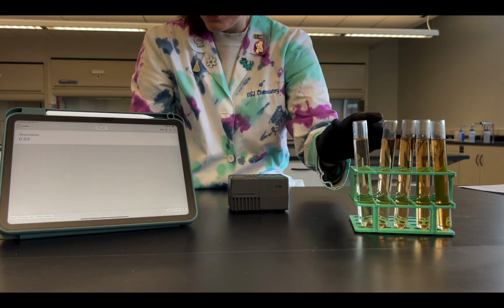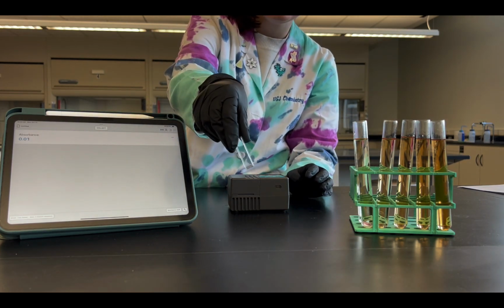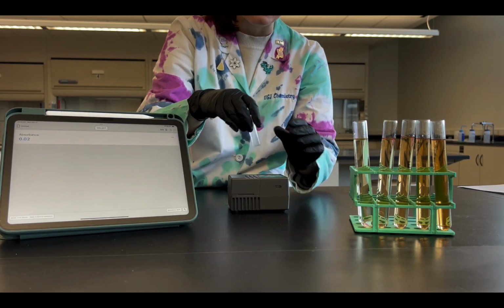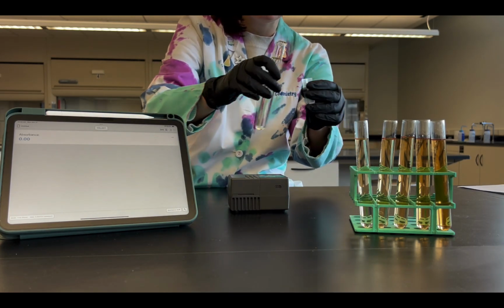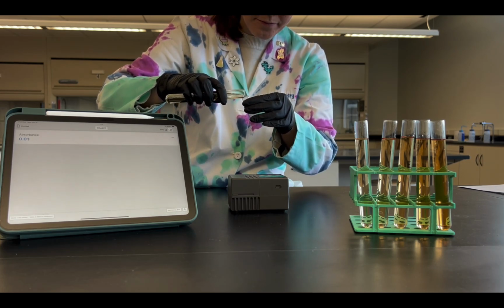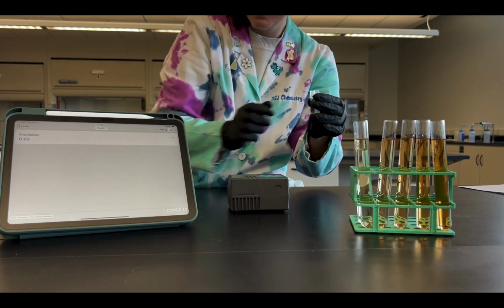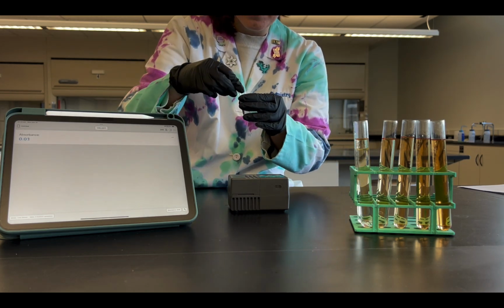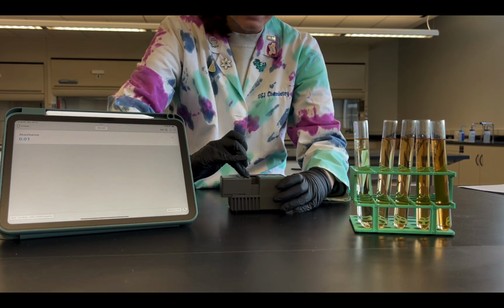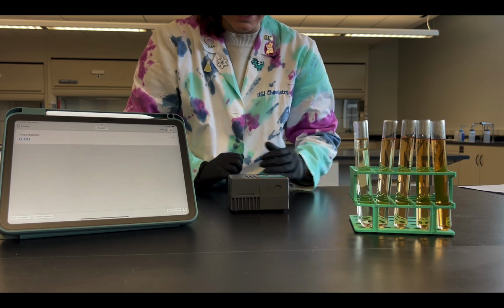To do that, I'm going to take this, which is a cuvette. It's just a smaller little container that I can put directly into my colorimeter, and I'm going to put some of my blank in there. Then I'm going to cap off my cuvette to make sure I don't spill any of it, put it right into my colorimeter, and hit the calibrate button.